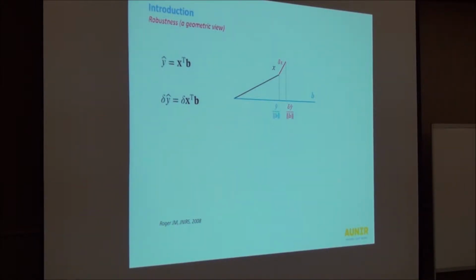Another solution to reduce the error is to reduce the B vector, to have a parsimonious model. So the B coefficients could be reduced, not to use too many factors, for example, not to overfit. That can help as well.